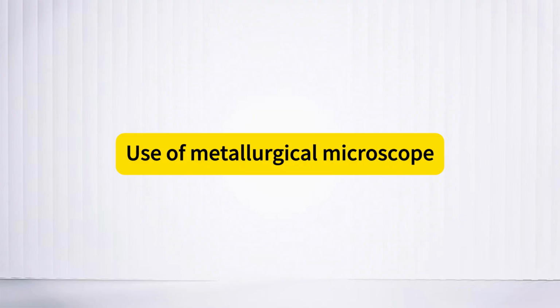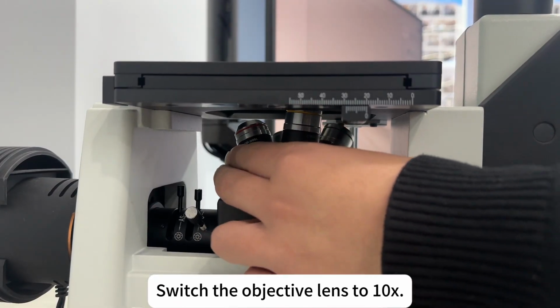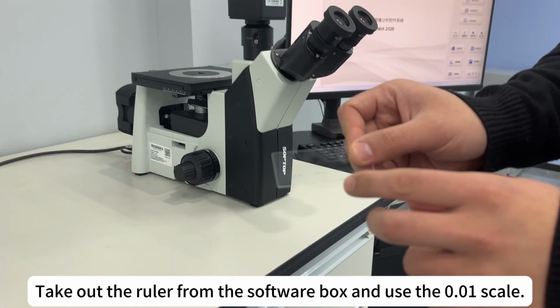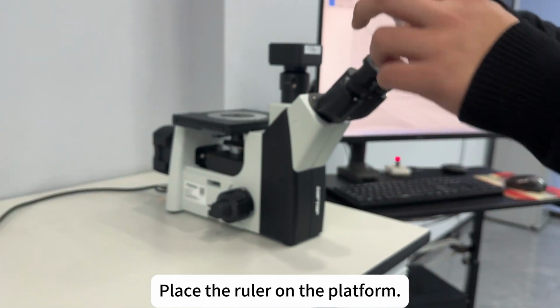Use of metallurgical microscope. Turn on the switch on the right side of the microscope. Switch the objective lens to 10x. Take out the ruler from the software box and use the 0.01 scale. Place the ruler on the platform.